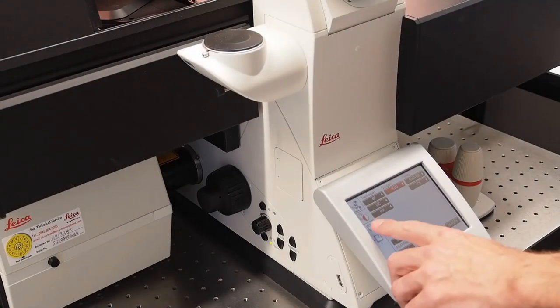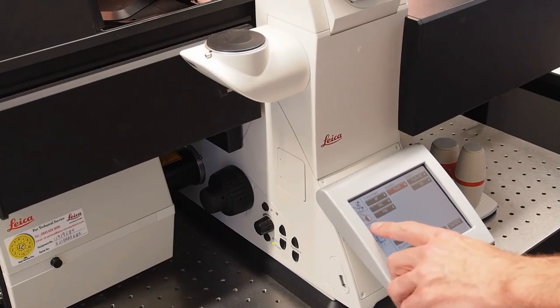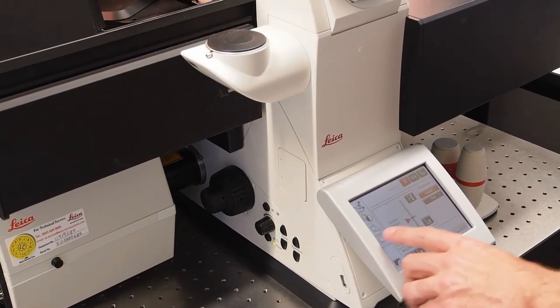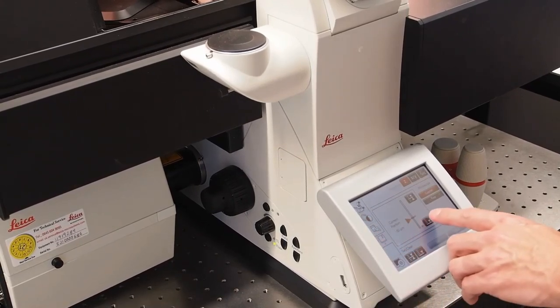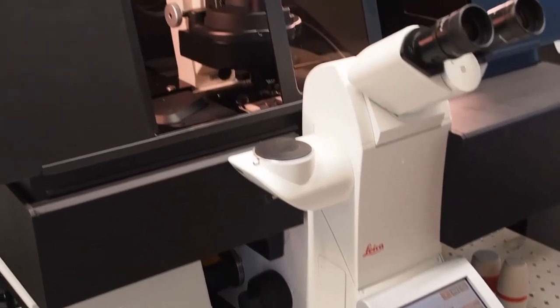This video shows you how to shut down the NICR SP microscope. Press the stage control button on the touch screen and bring the objective all the way down.